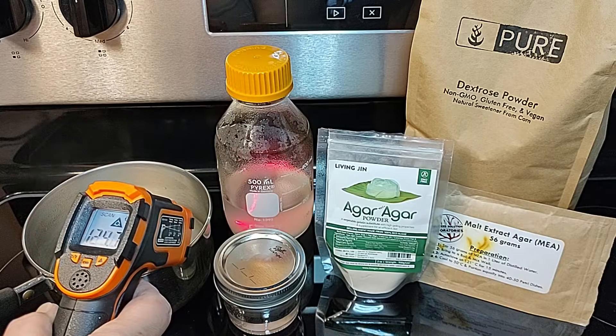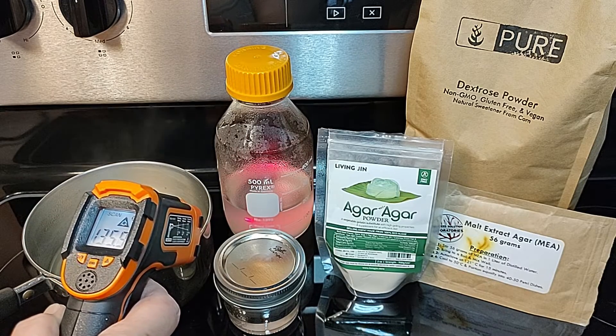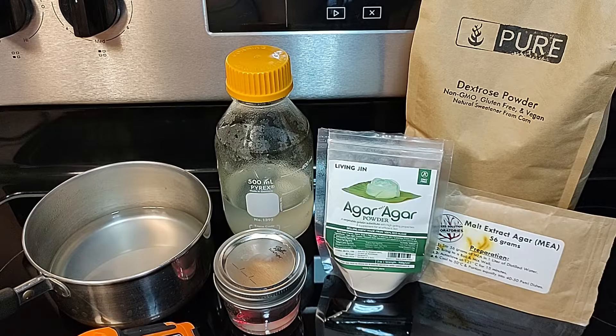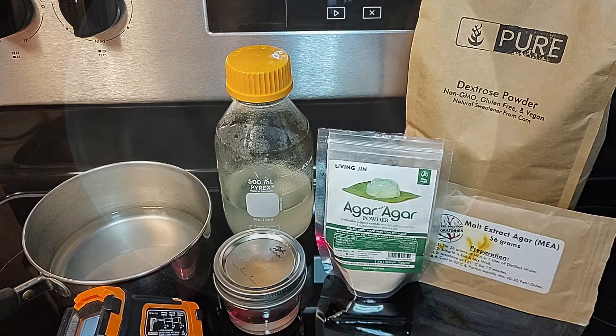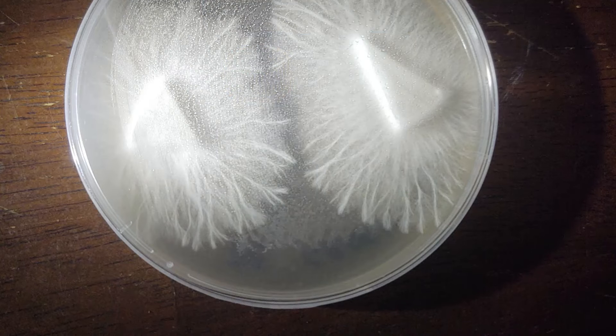In one of our previous videos, we discussed how to make an MEA, or malt extract agar. We found that the results were amazing after we made our transfers, but we weren't getting that amazing rhizomorphic growth we wanted.